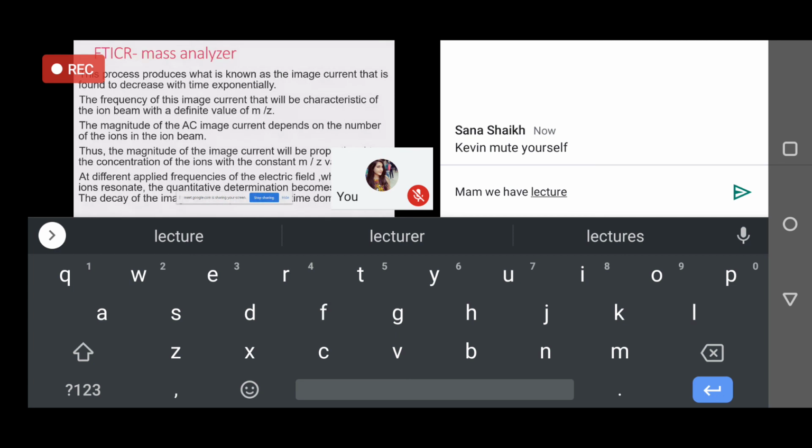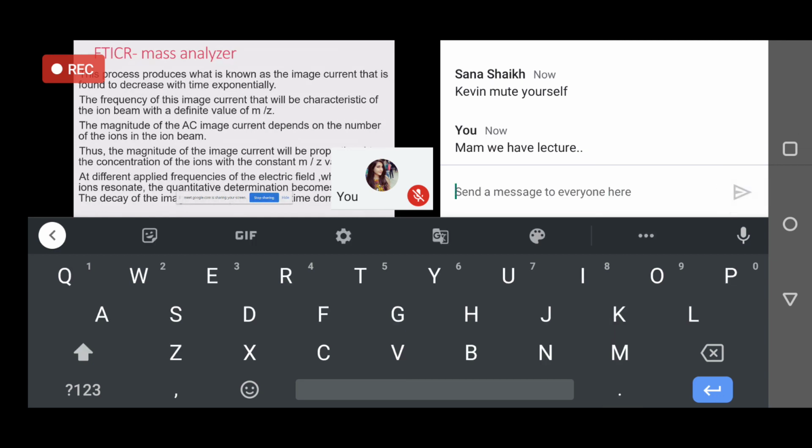This is a measurement done in the time domain. So we are changing the electric field and measuring the collector electrode current as a function of time, because all Fourier transform measurements are done as time domain measurements.